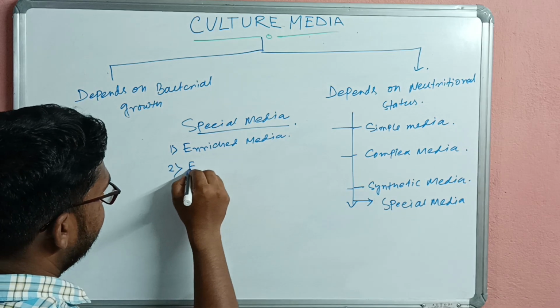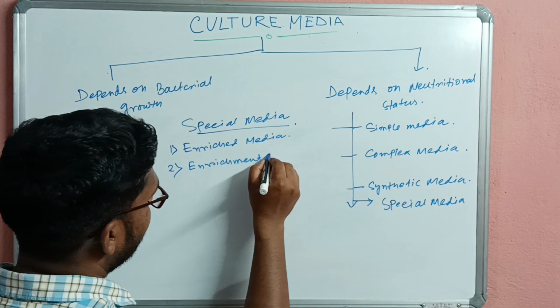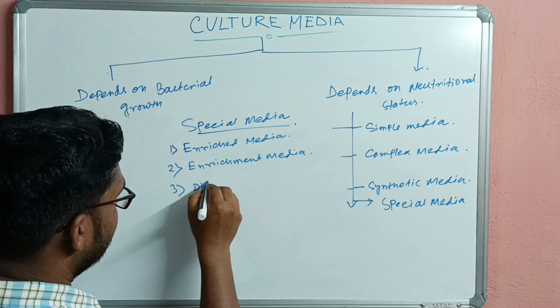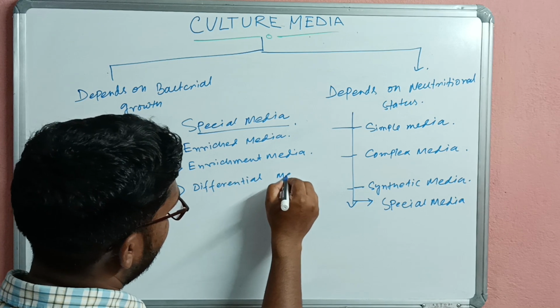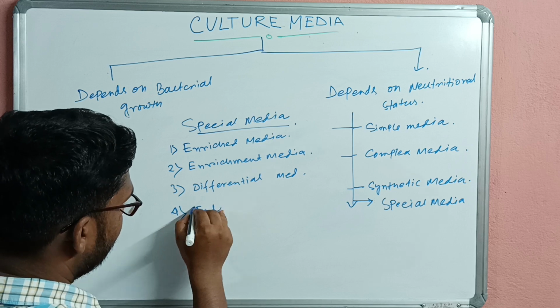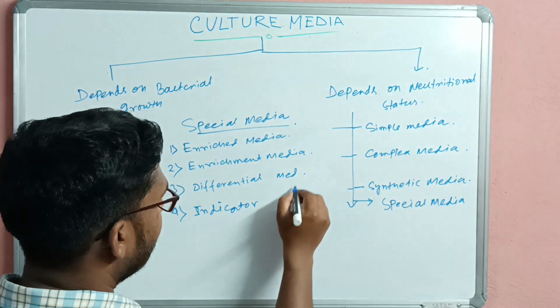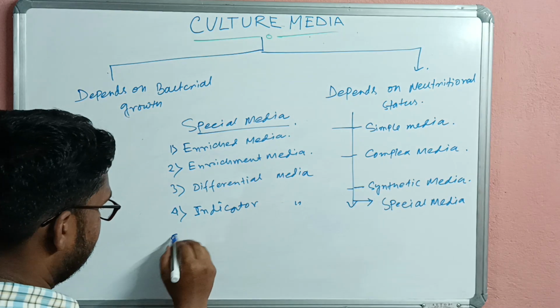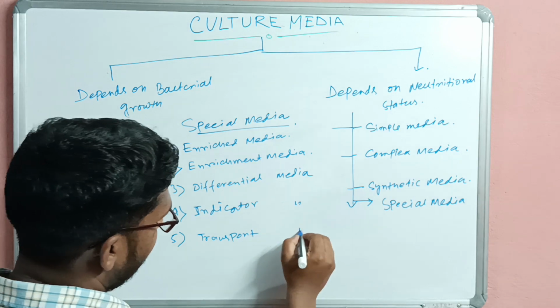Number two, enrichment. Differential. Indicator. Transport.